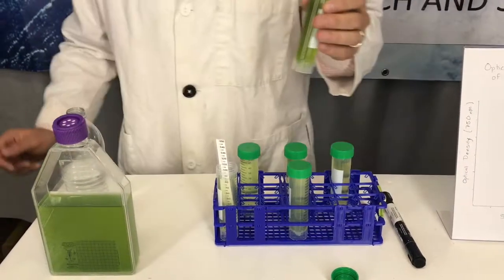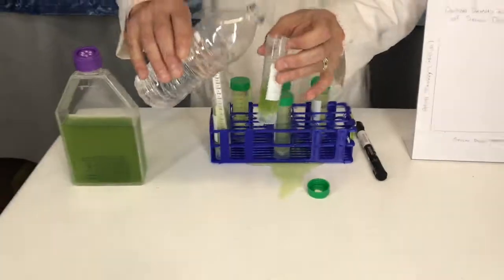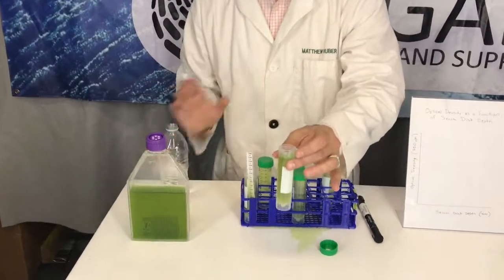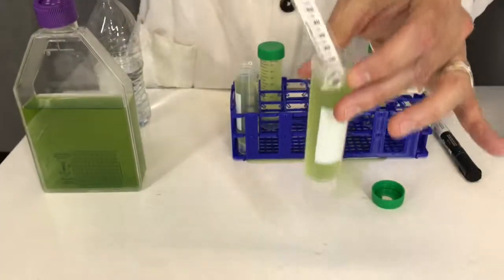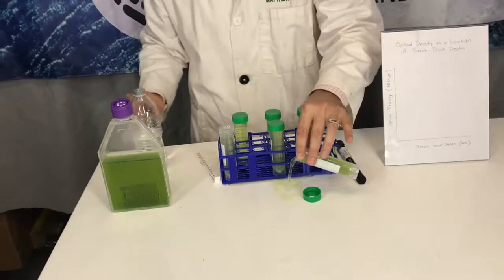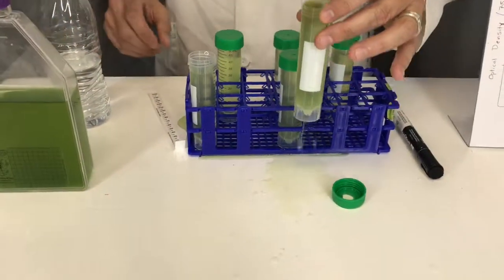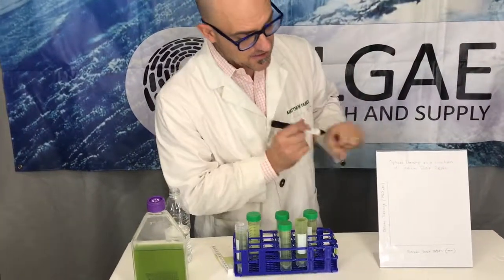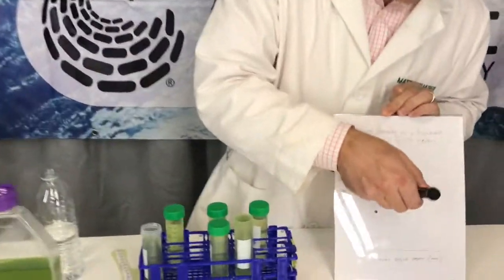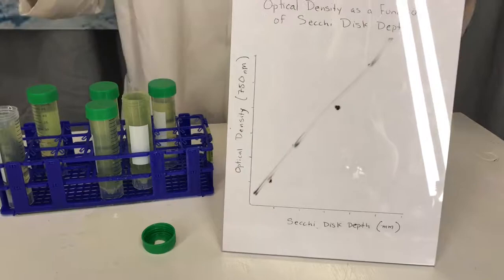Then put it right into your cuvette for the spectrophotometer. Go ahead and dump out some of your culture and do it again. I like to do things on a log scale — get your next optical density and repeat. Don't let your students do the dumping or you'll have a big mess. Once you do that a handful of times, you'll get good numbers and be able to plot your results and use math.